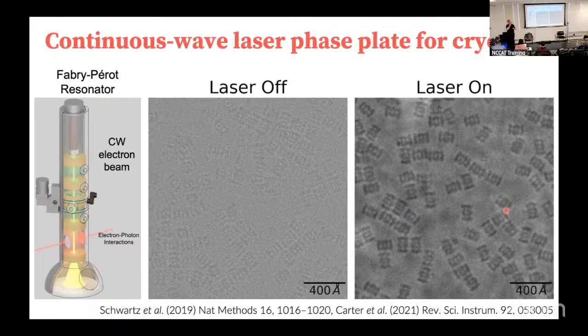And no resonator. So you really are just doing, you have an optical window. When I say a window, I mean we go up to the microscope and we've drilled a hole and put in a vacuum sealed, O-ring sealed port where you have some metal, and then in the middle you have laser transmittable glass that can tolerate high fluence lasers, and you can literally see into where you're going.